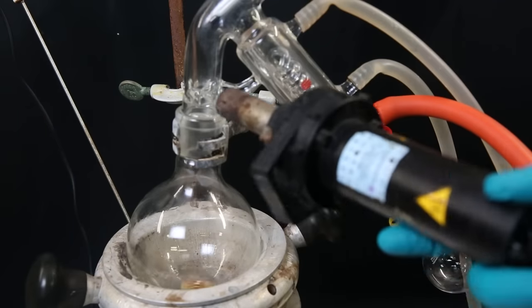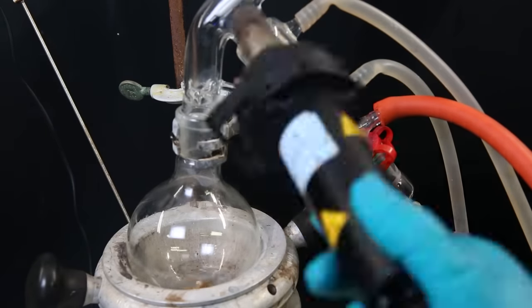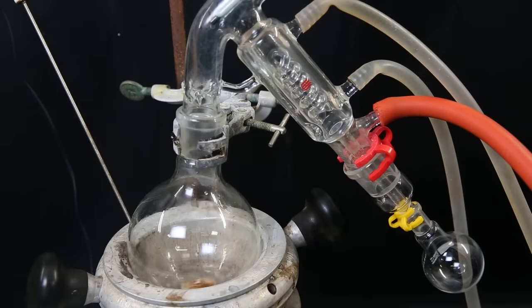When all of the ether has been pulled out, I swap the receiving flask. I now pull a strong vacuum on the setup, increase the heat, and distill over the tributyltin hydride with the help of a heat gun.